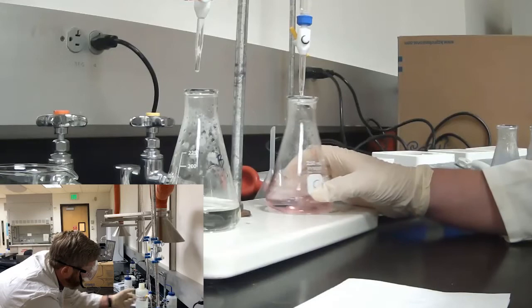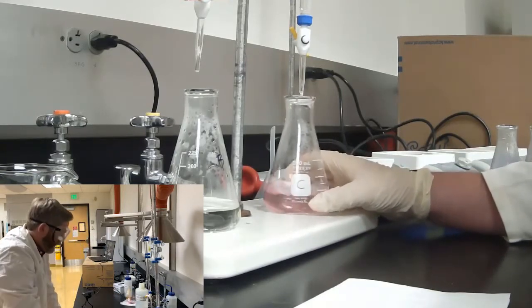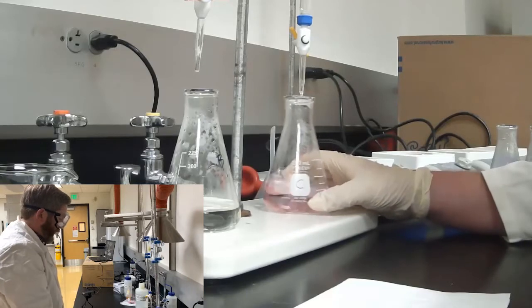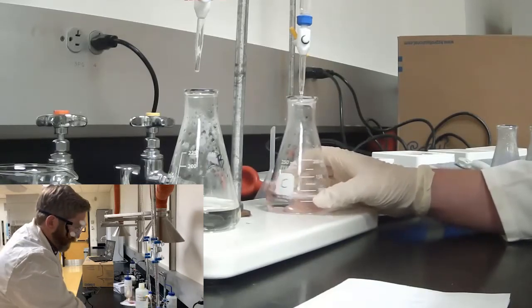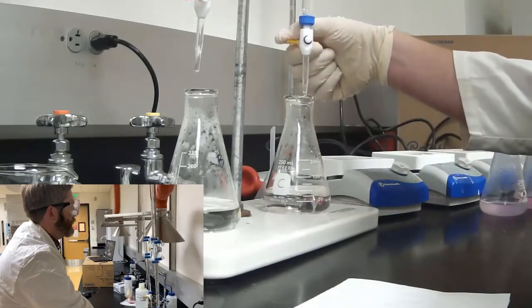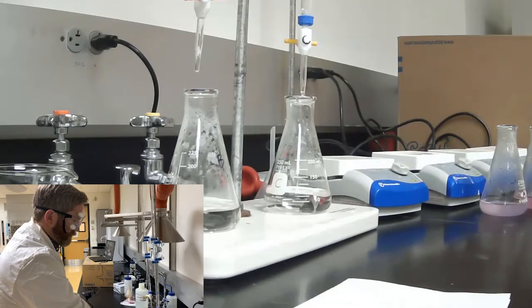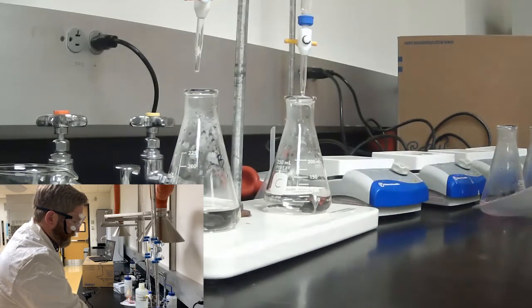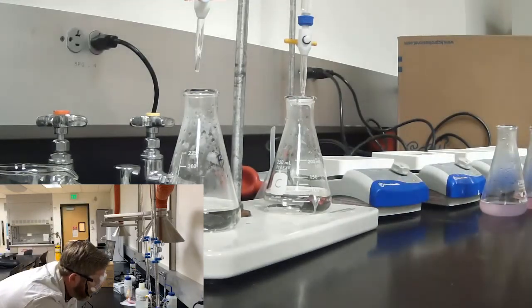Okay, so we can see from the color change, we have eliminated all of our initial color, which indicates that the acid has been neutralized. We'll go ahead and do this one, then we'll take our burette measurements. So now that I know approximately how far. And because we know that about the same mass, we'll do the drops a little bit faster than this one.